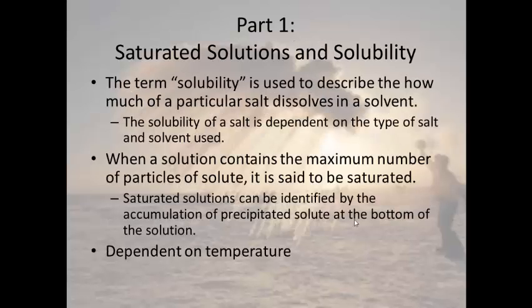In part 1 of this lab, you'll be investigating saturated solutions and solubility. The term solubility is used to describe how much of a particular salt dissolves in that solvent. And it depends on the type of salt that it is, the solvent that's being used, as well as temperature. When a solution contains the maximum number of solute particles, it's said to be saturated.